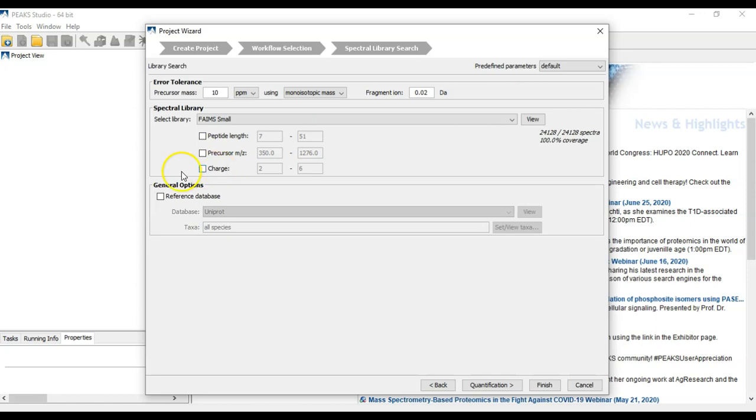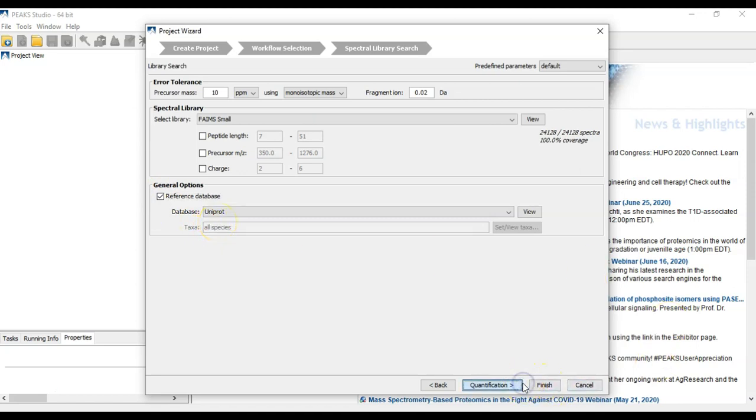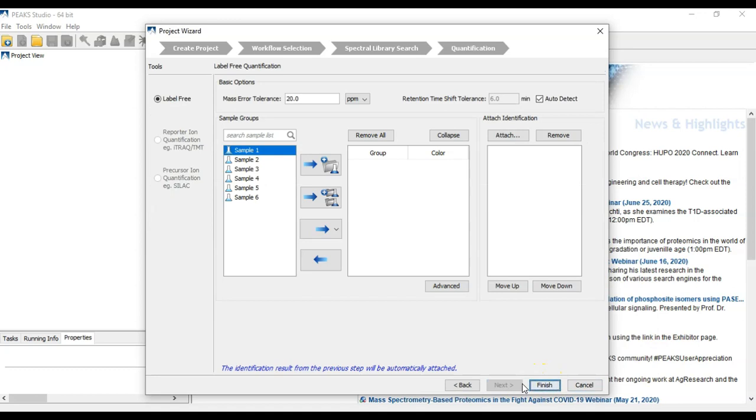As well, we could set up a protein database for protein inference. And continue to quantification. Here, all you'd have to do is set up your conditions.